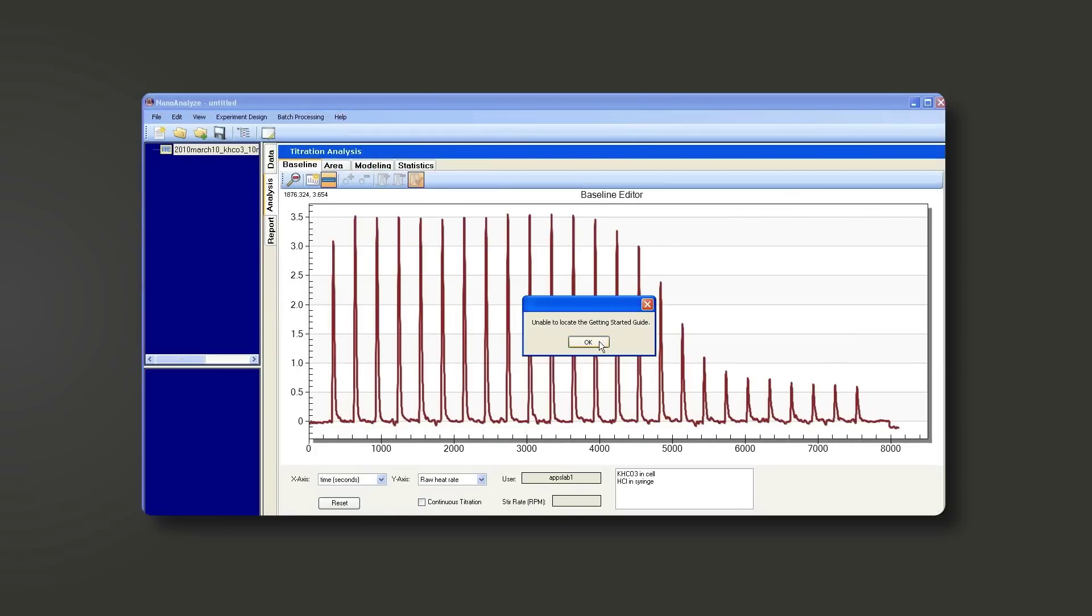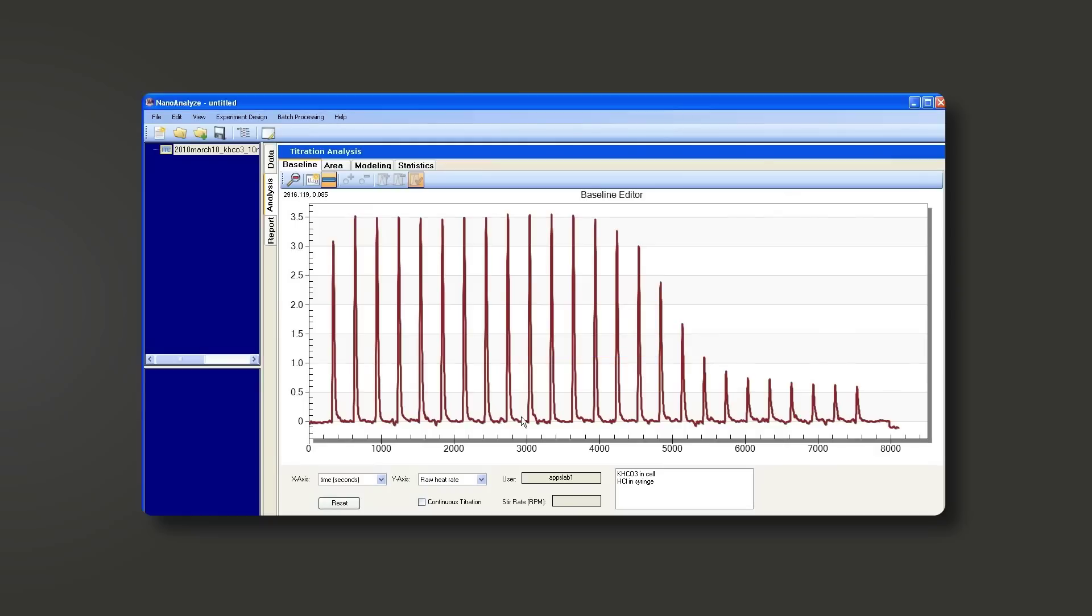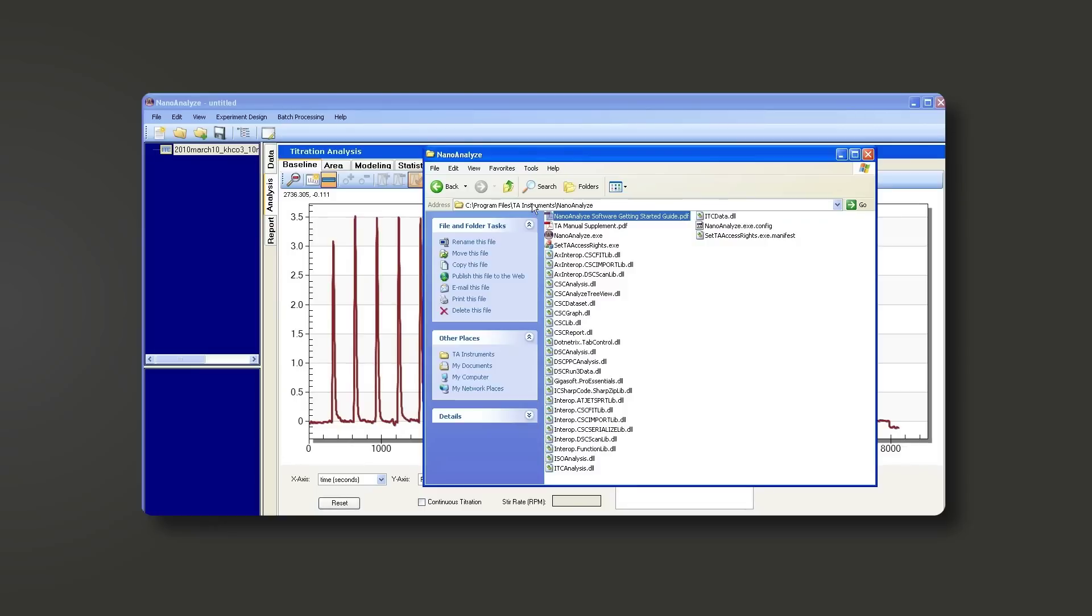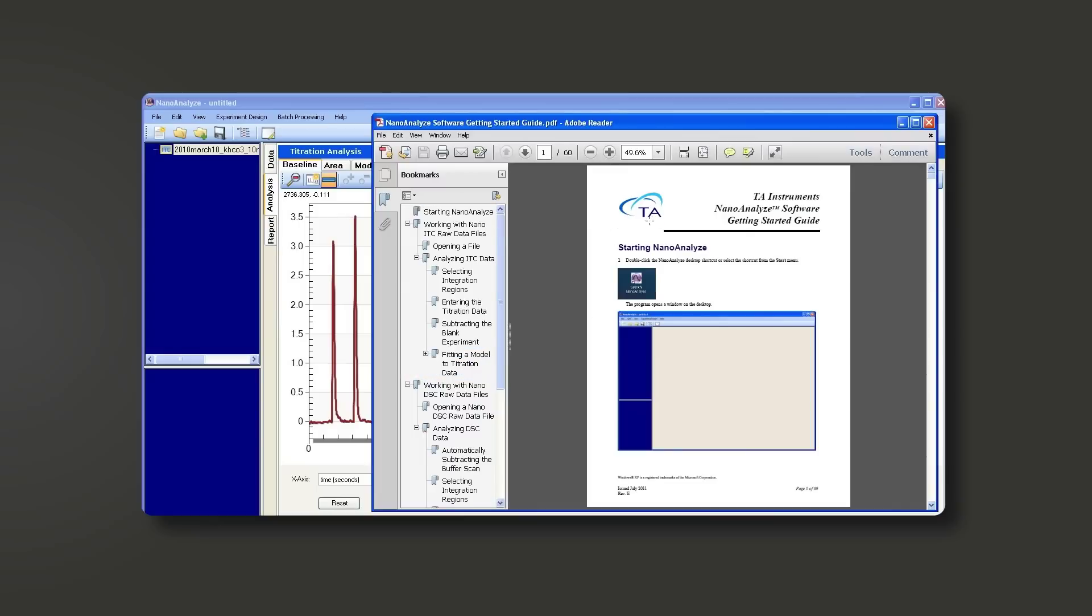If you have trouble with Windows and opening from the help menu, you can always go to your hard drive and explore through your computer. Go to the C drive, program files, TA instruments, and Nano Analyze. Both of these files will be on your computer if you have Nano Analyze installed. You just double click and now you have the instructions.